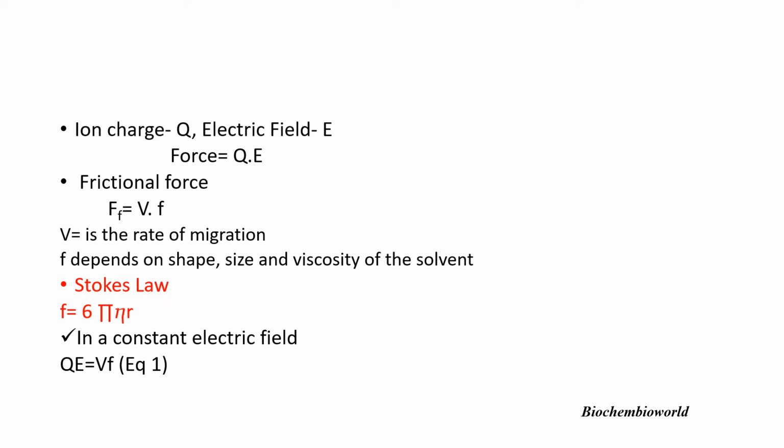The frictional coefficient for a globular charged molecule is given by Stokes law and is equal to 6 pi eta r, where eta is the viscosity of the solvent and r is the radius of that globular shaped charged molecule. In a constant electric field, these two forces are balanced, so QE is equal to Vf.